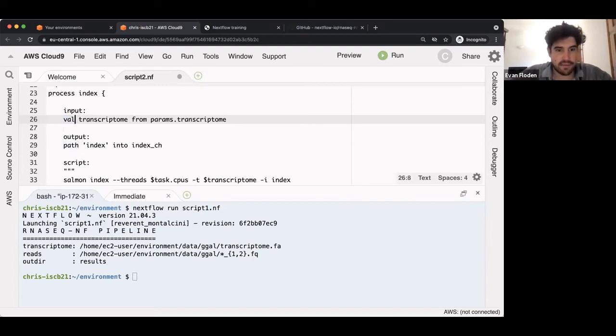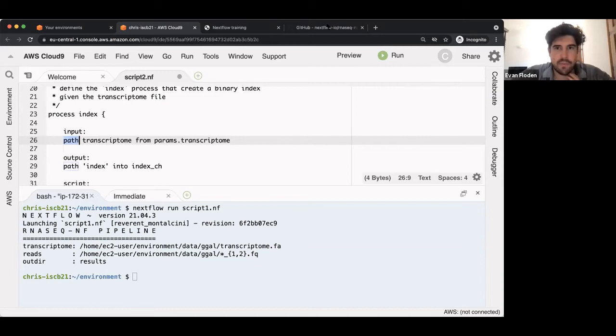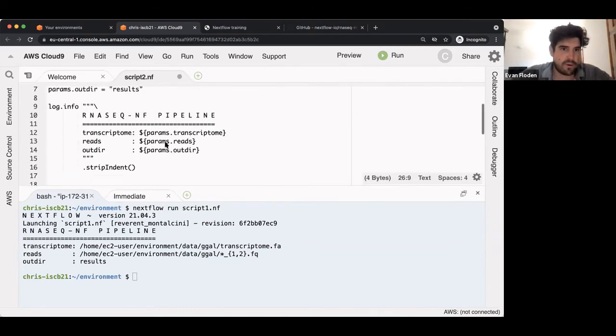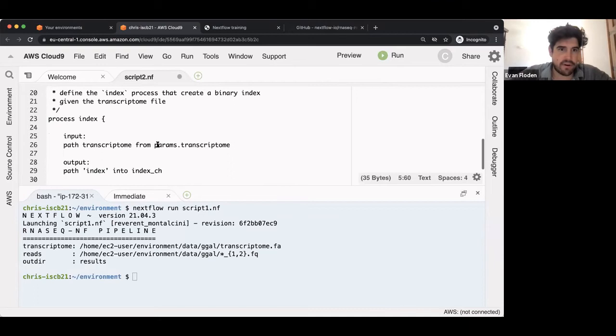So you're saying avoid using absolute paths for pipelines. Is that what you mean by that? Yeah, exactly. So let's say like this: when you input this here, you will create this here, and this is still a string. When it gets to here, though, it gets converted into a path, and this is quite interesting.